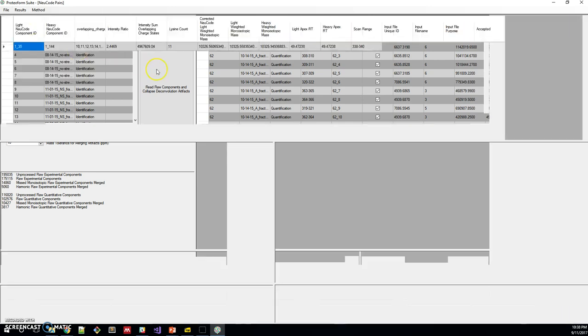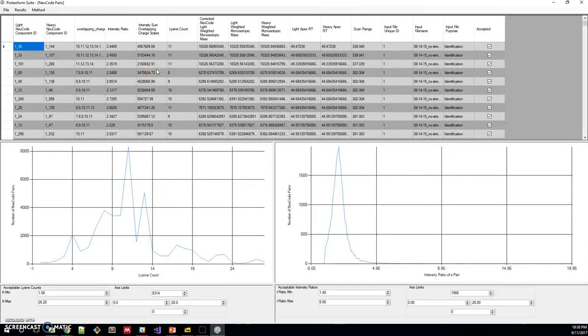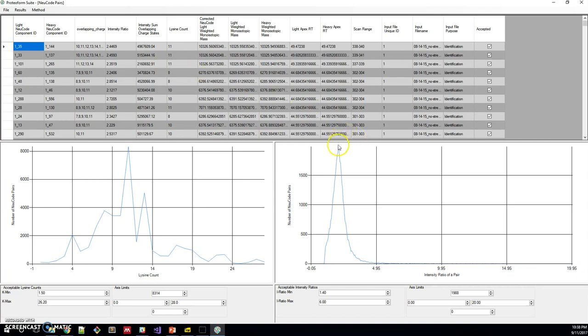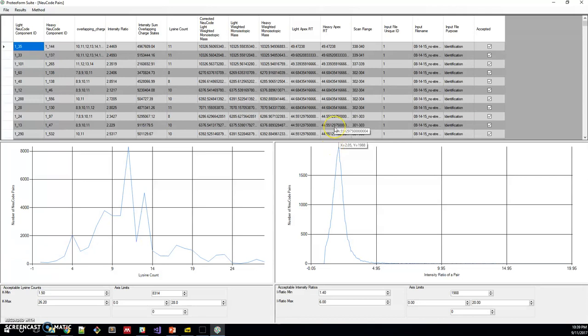Then we pair. For identifying proteoforms, we pair masses with a 2 to 1 neucode labeled ratio by design. You can see that these are the neucode pairs and the peak intensity ratio is just about 2.